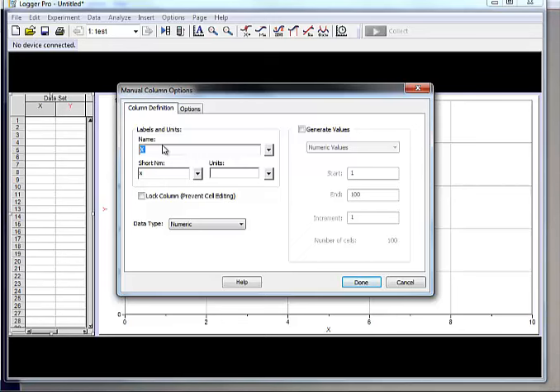Now we need to be specific about it. How are we measuring the amount here? In grams, which is a measurement of what dimension? Grams is the unit of measurement. What is the dimension it's measuring?